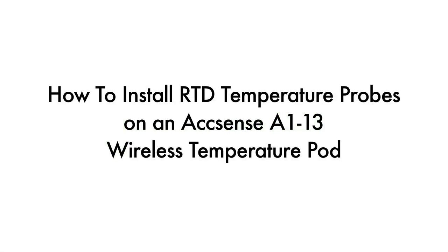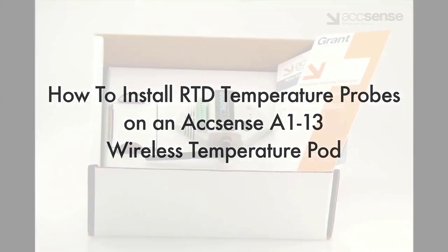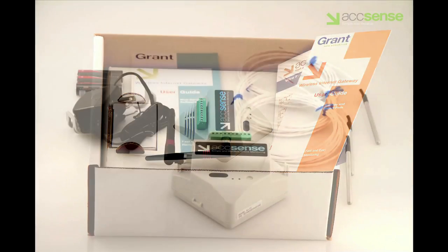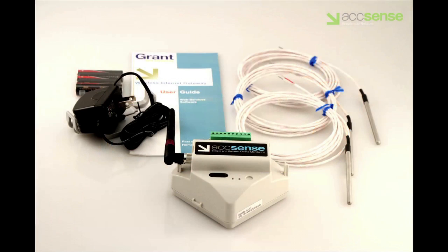This video describes the installation of RTD temperature probes on the Accensense Model A113 wireless temperature pod. The Model A113 comes with these accessories.